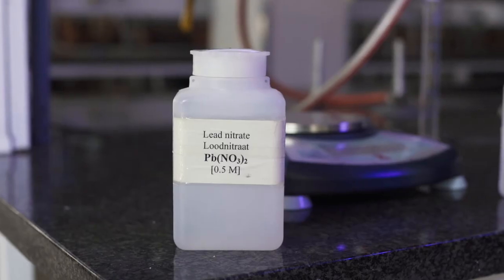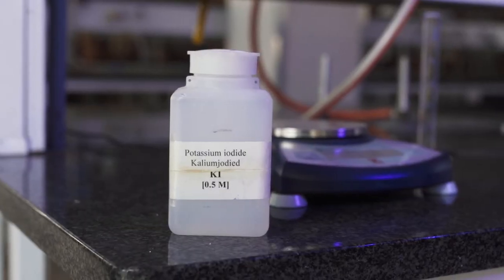The topic of experiment two is stoichiometry. In this experiment, we will perform a precipitation reaction by adding known volumes of lead nitrate and potassium iodide.